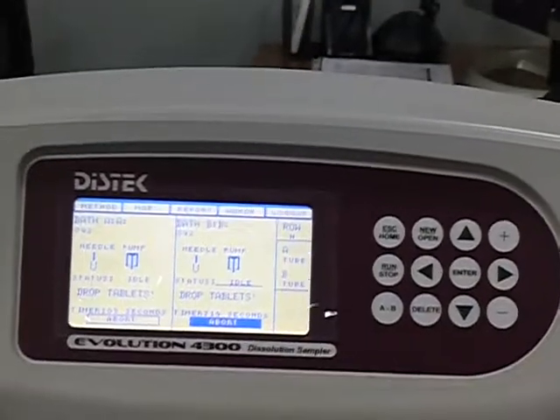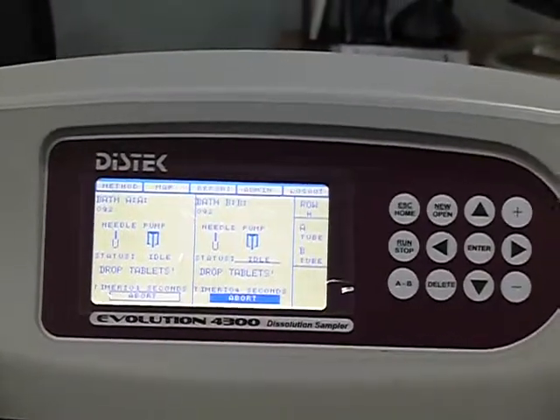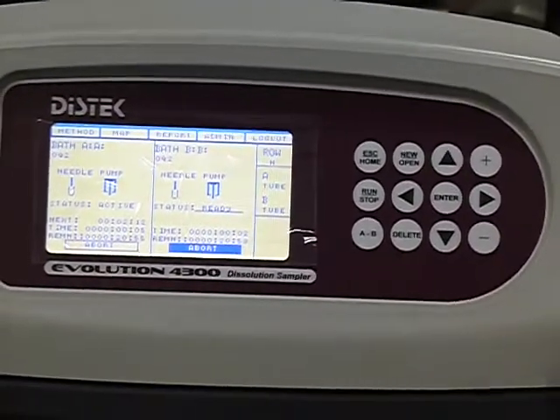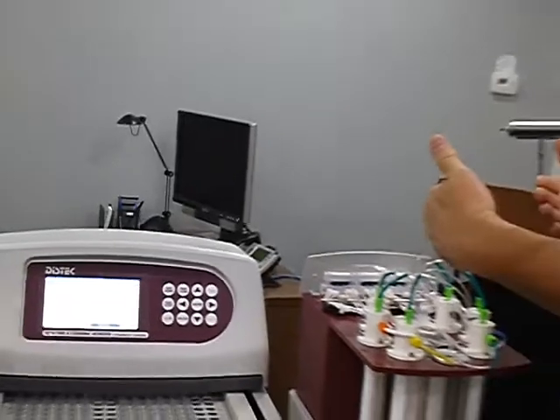In the list of methods, some methods, you may have to explain to a customer that they tried starting this one and then they wanted to start this other one and it wouldn't start. It's not going to start because if it senses a time conflict anywhere during the course of that run, that this one is going to interfere, it's going to have you hold off.